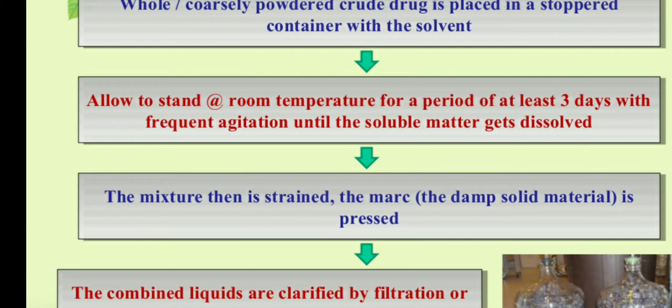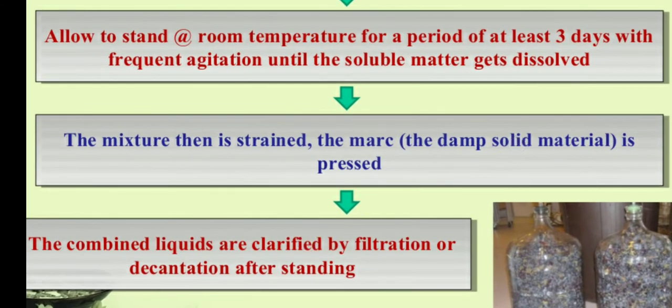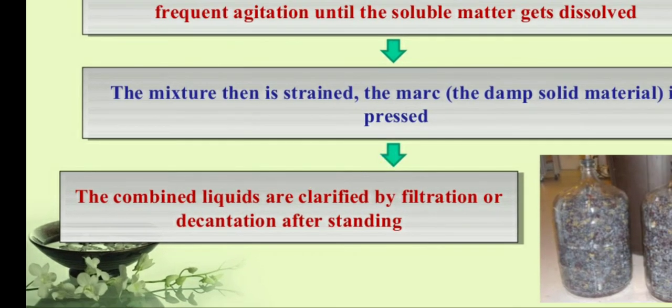Agitate the mixture until the soluble matter dissolves. Then the damp solid material is pressed. The marc is nothing but the damp solid material that is pressed. The combined liquids are clarified by filtration or decantation after standing.